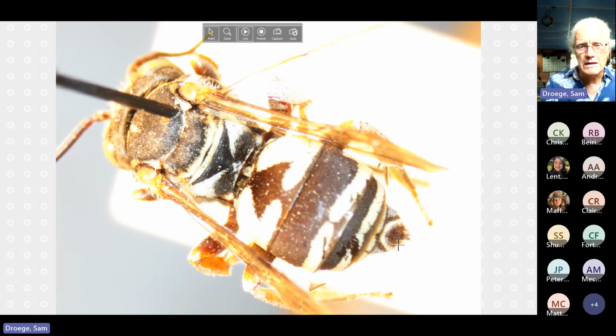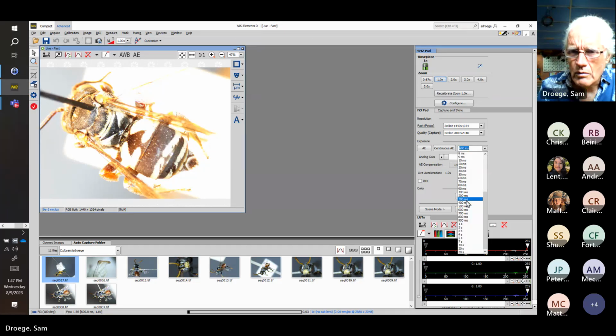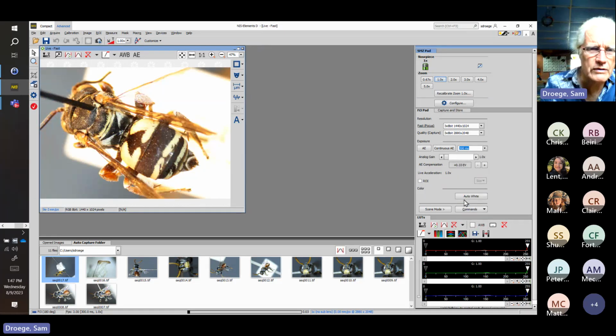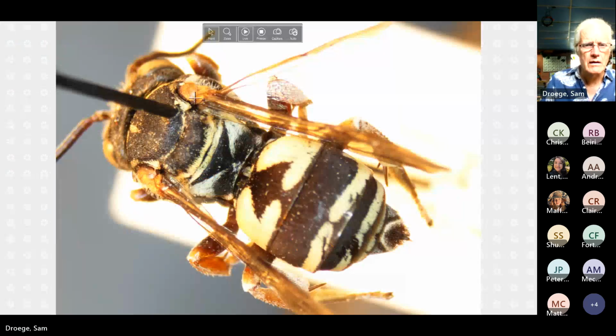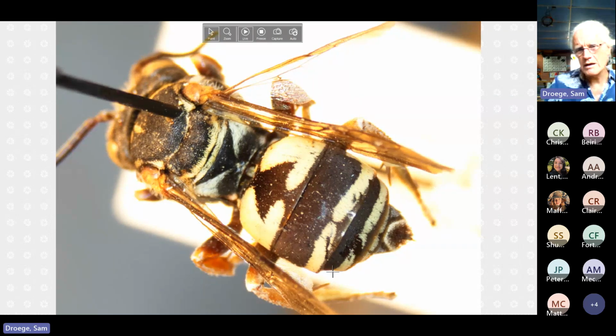But let me change the light level here. And we will take it down to that. So hopefully, okay, yeah, not bad. So again, let's bring this up to full screen. The processing issues here in color rendition through pictures and also on the screen. And maybe I'll try and pull up remigatus there, but this bit of yellowish here and then bright white down there, that's what we're looking at.